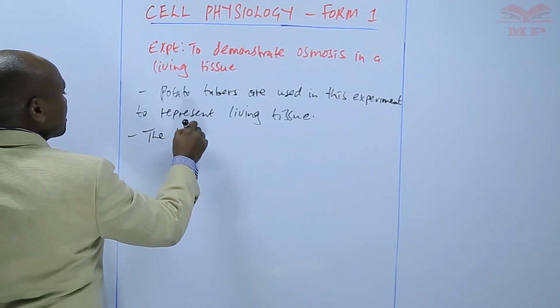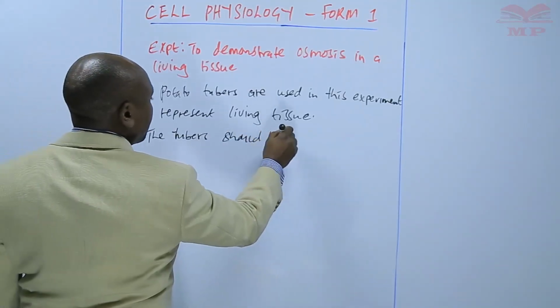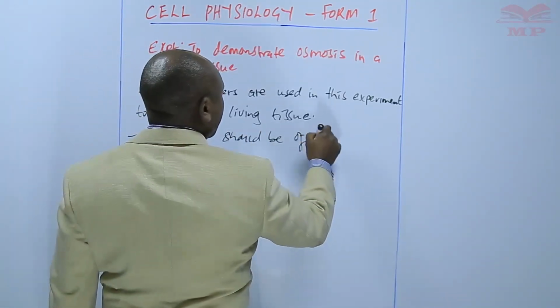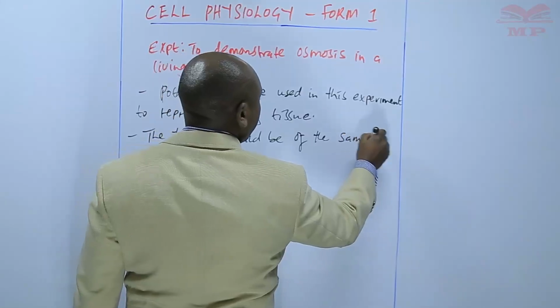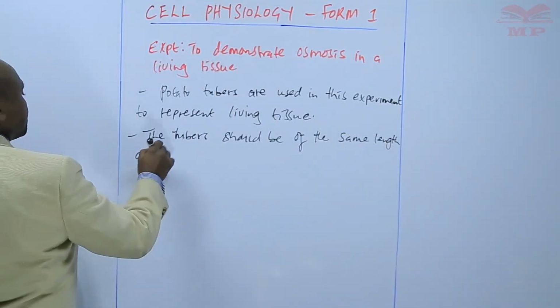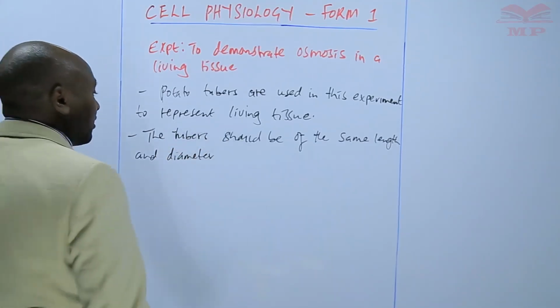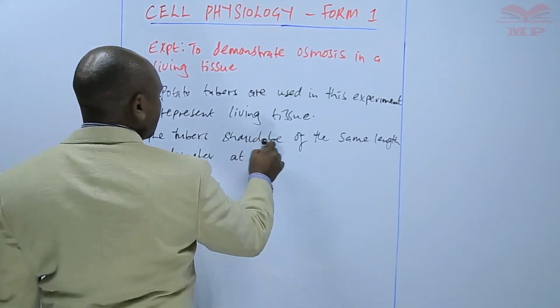The tubers should be of the same length and diameter at the beginning of the experiment.